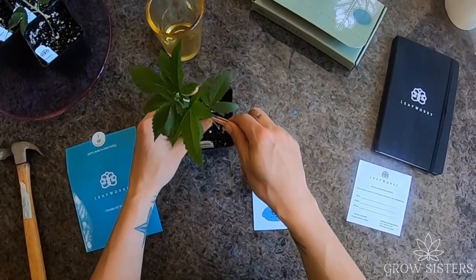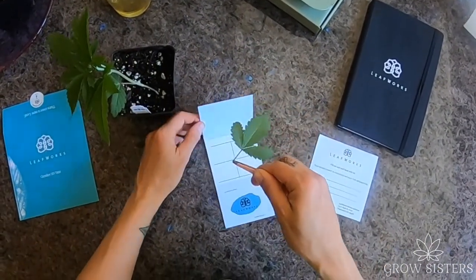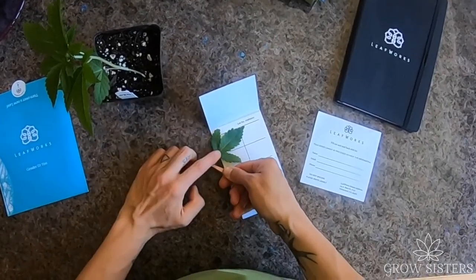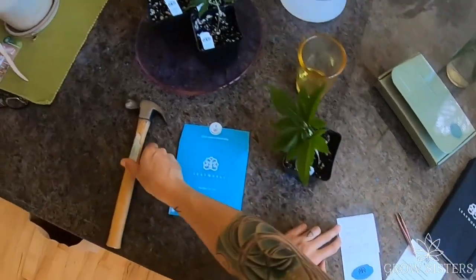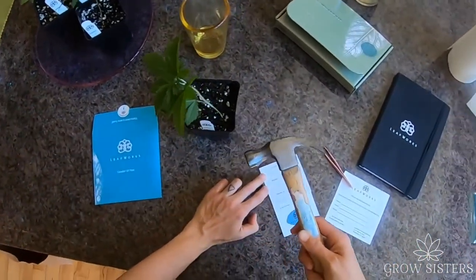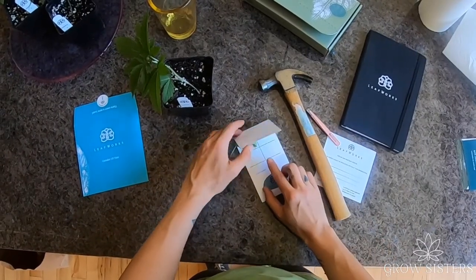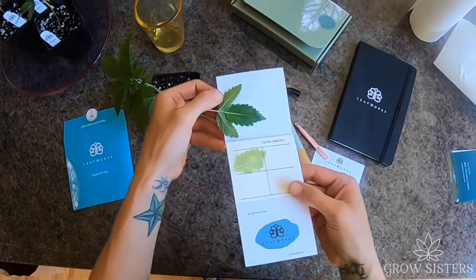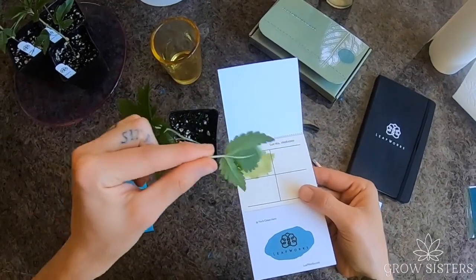Using the tweezers, collect one leaf from your first plant. Place the leaf in the corresponding quadrant. Close the top of the card. Strike five to ten times with a blunt object over the collection spot to produce the DNA print. This is very important to get a good print, so be sure to smash.